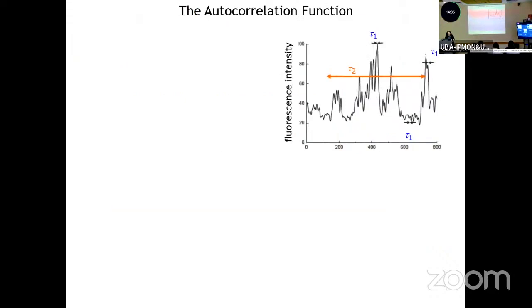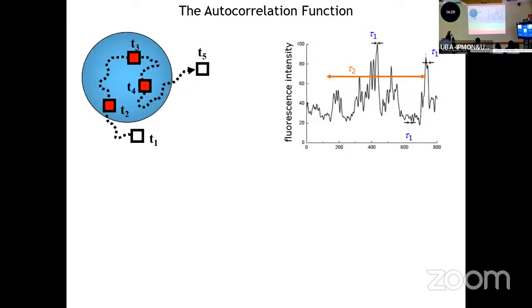Okay, so we have here fluorescence intensity as a function of time for a molecule that's entering our observation volume. And at some point in time, it's going to give off a photon. It's not going to be emitting the entire time, right? It's going to be emitting because we're pulsing, right? We have a pulse duration time, we have a frequency. So eventually a photon is going to be emitted at a given time. If the molecule stays in our volume, it's going to emit another photon, and as it continuously diffuses, it's going to emit another photon. That's going to happen very, very quickly and very fast.